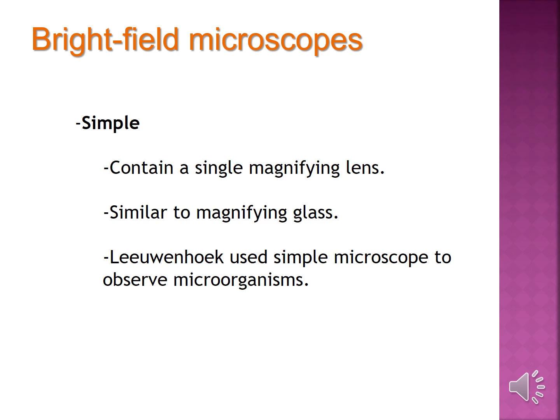Bright field microscopes are simple. They contain a single magnifying lens similar to a magnifying glass. Leeuwenhoek used a simple microscope to observe microorganisms.